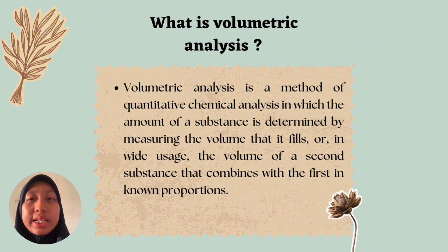is volumetric analysis. Volumetric analysis is a quantitative chemical analysis technique that measures the volume a material fills, or in more common usage, the volume of a second substance that combines with the first in known proportions to determine how much of the first substance is present.